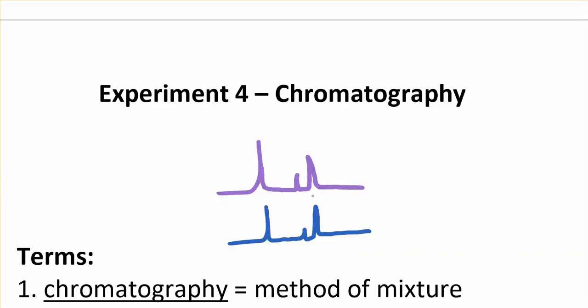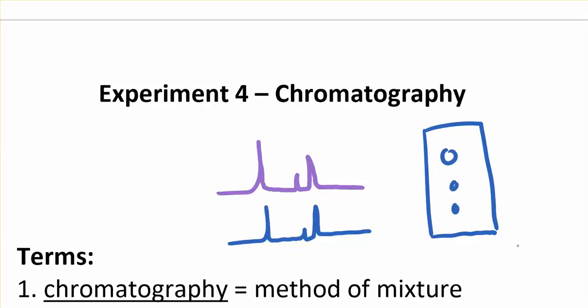Does that seem familiar? Well, that is chromatography. Sometimes in chromatography you end up with something like this that has peaks. Sometimes with chromatography, like in ours today, you'll have a piece of paper that will have a pattern of spots instead. But in either case, each peak represents one substance. So this one has 3 different substances. And in this type, each spot represents one substance.